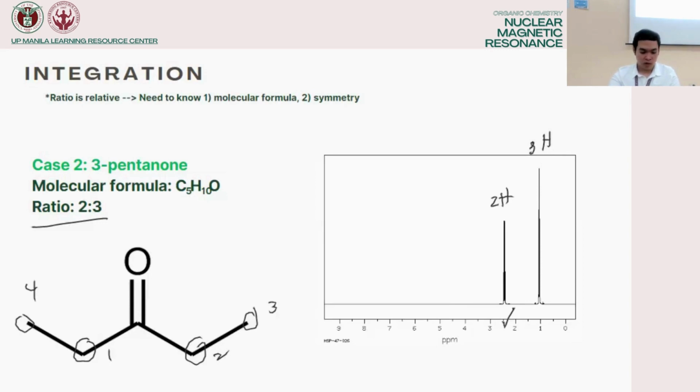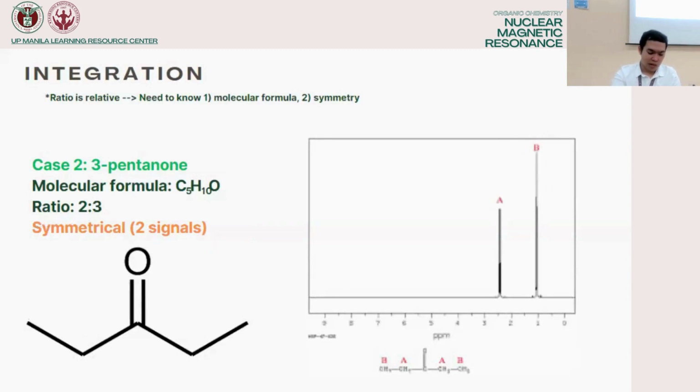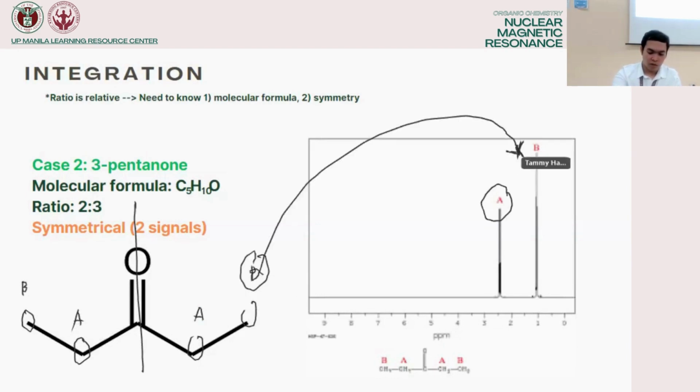4 equals to 3. Correct. Sabi isang classmate nyo, ganito. Bakit? It has to do with symmetry. Symmetry. No? So, syempre, symmetrical yan. Hatiin mo dito. Ito equal to dito. Ito equal to dito. Hence, this is A. And this is B. O, bakit si B ay nandito? Sige nga, na common sense. Kanina pa tayo dyan. Malayo siya? Oh, electronegative. Oh, may natututunan.